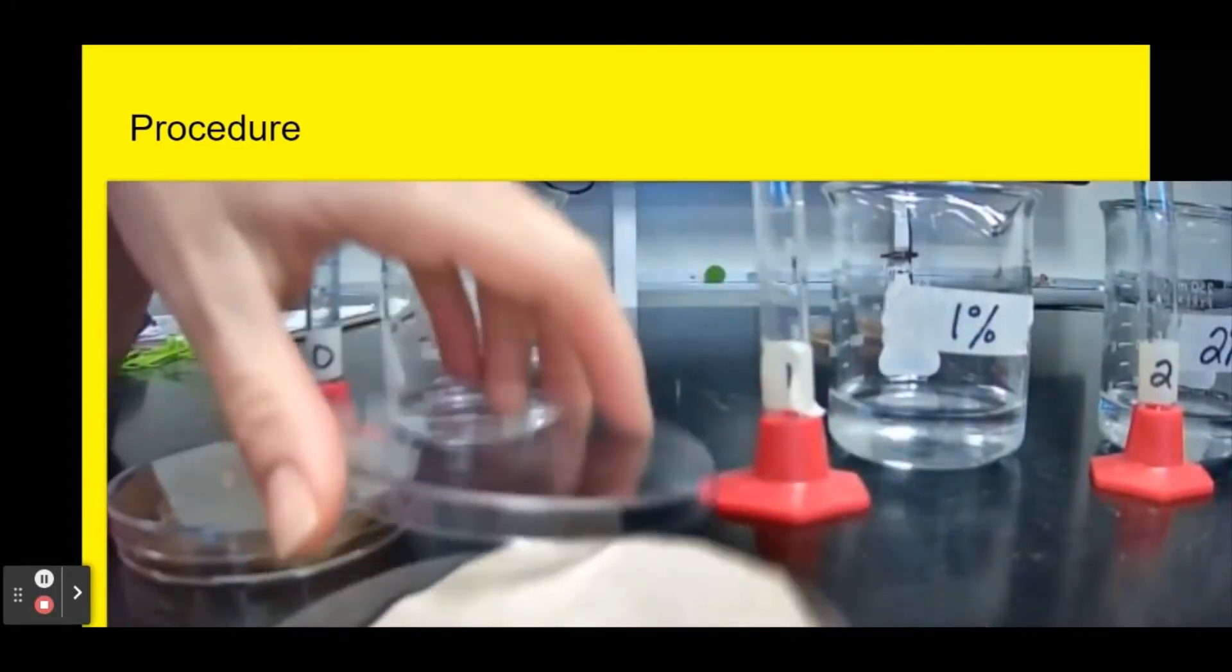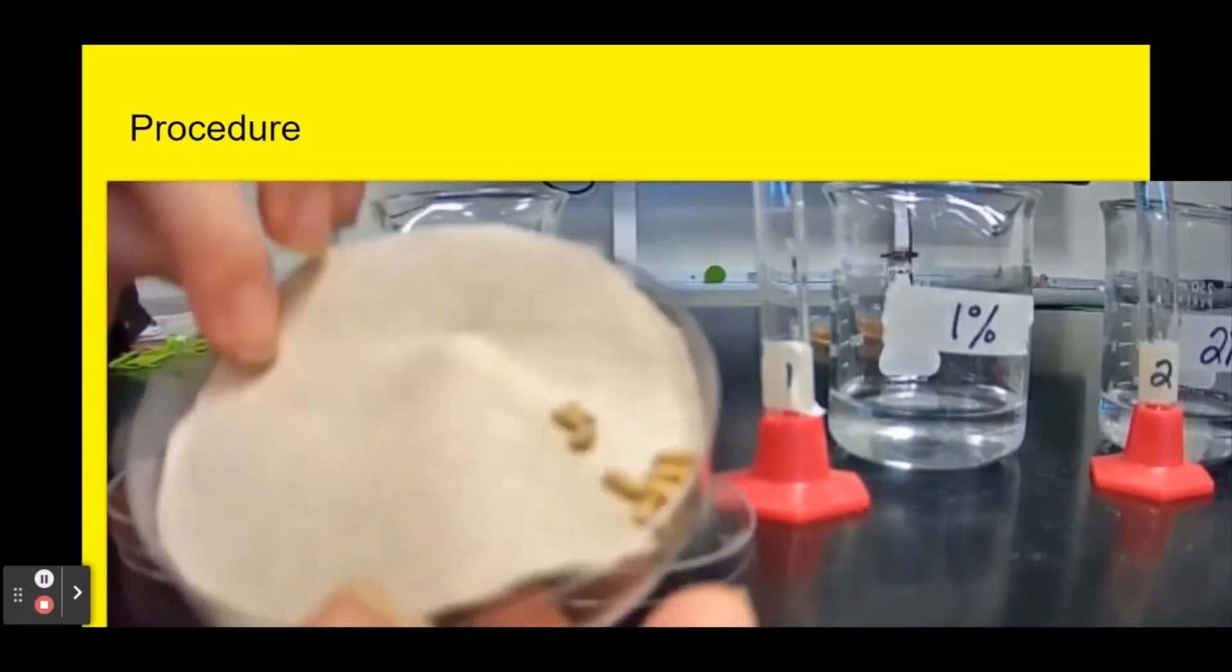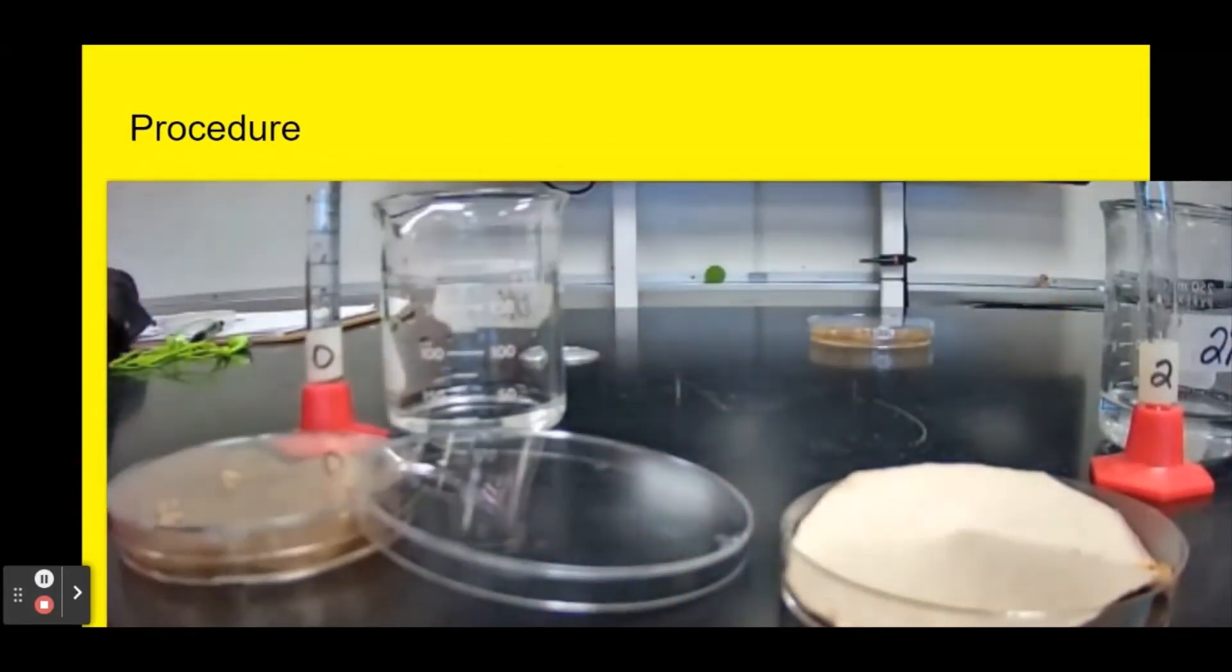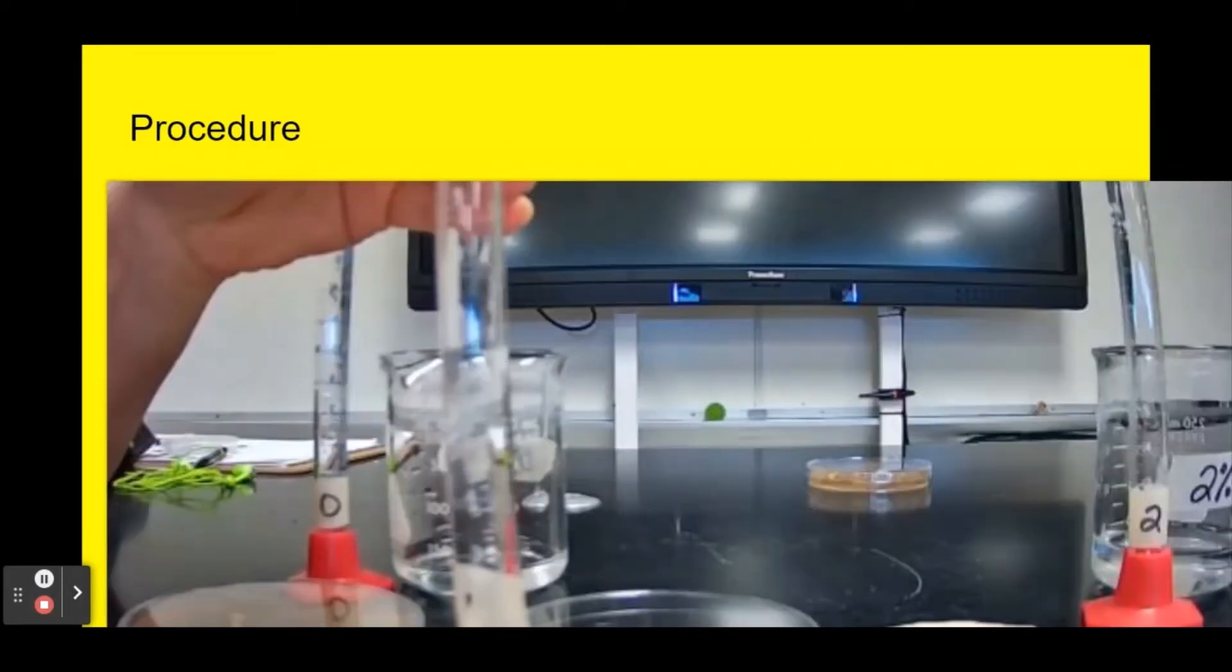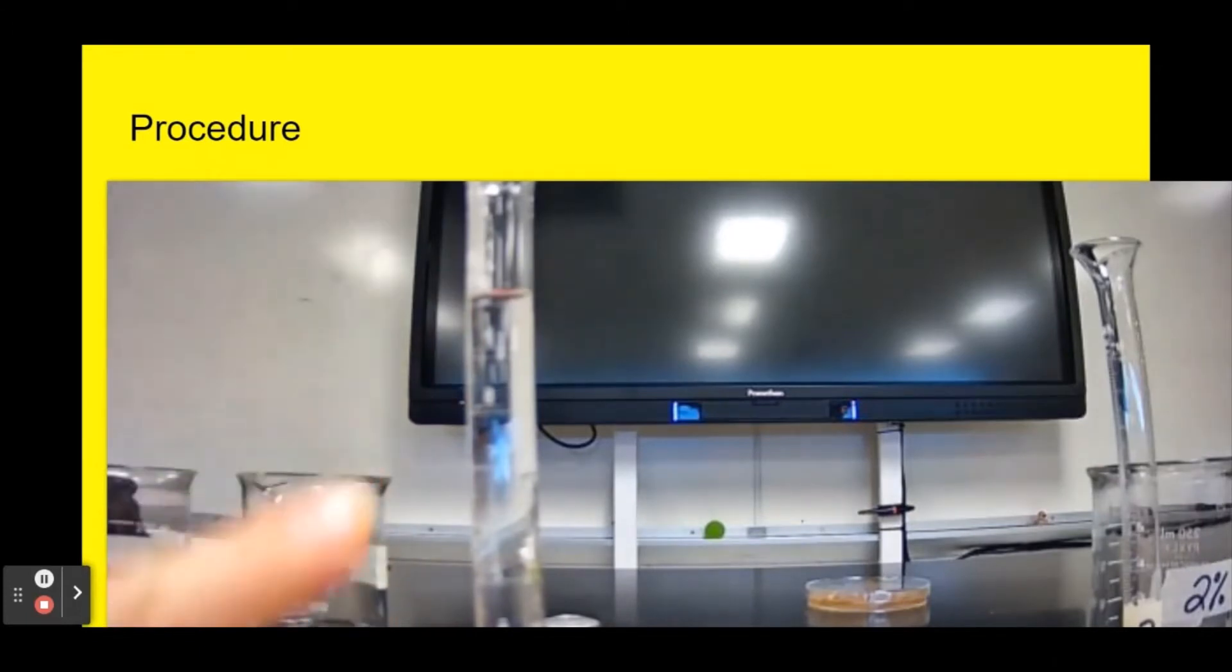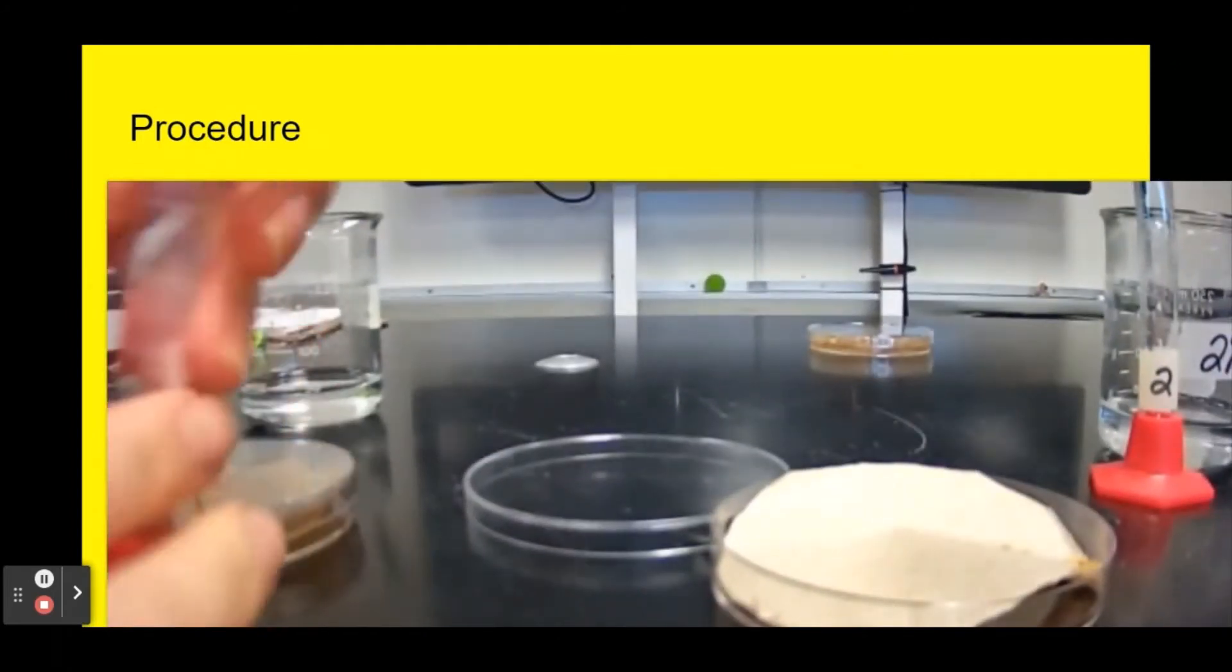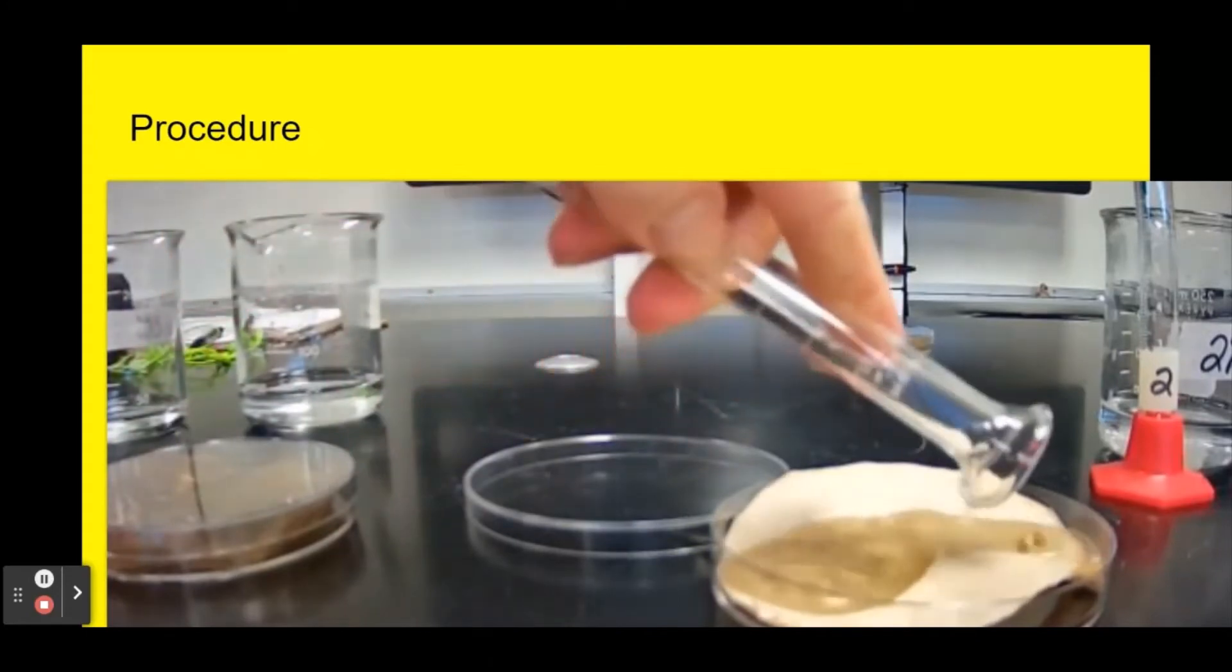I'm now going to do the similar setup for my one percent solution. You'll see I've got my tray with two paper towels and 10 seeds and I'm going to fill it up to 10 milliliters. The bottom of the meniscus is at 10. This is 10 milliliters of one percent acid and I'm going to pour that on my paper towel.